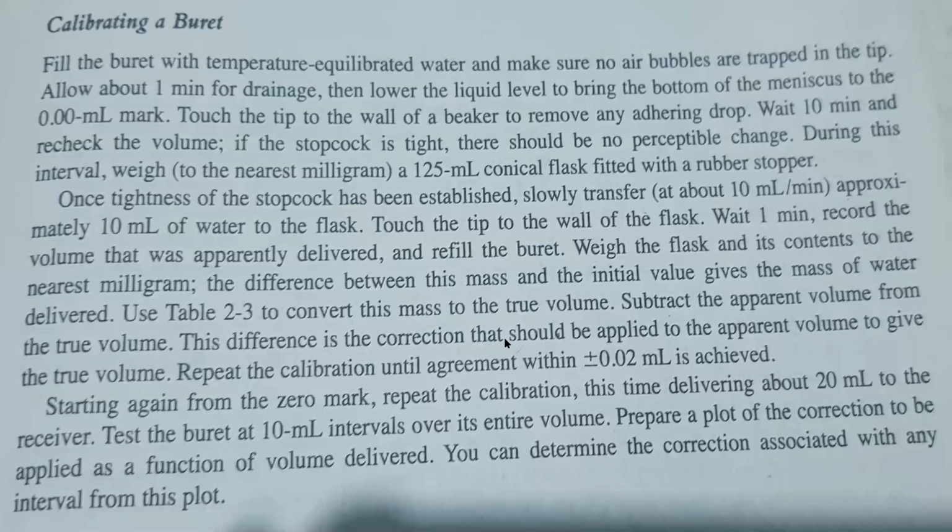I'll give you an example later. So the difference is the correction that should be applied to the apparent volume to give the true volume. So repeat the calibration until agreement within plus and minus 0.02 ml is achieved. And then we will just repeat the whole procedure for the calibration of the burette.